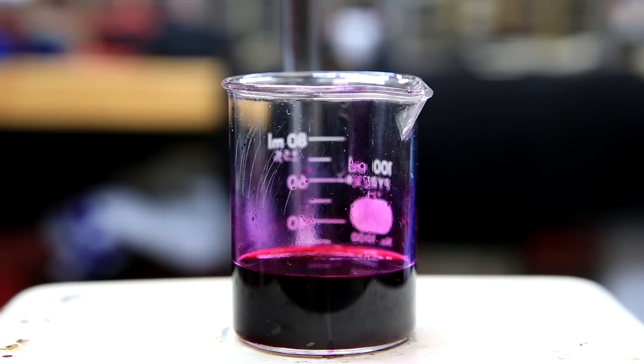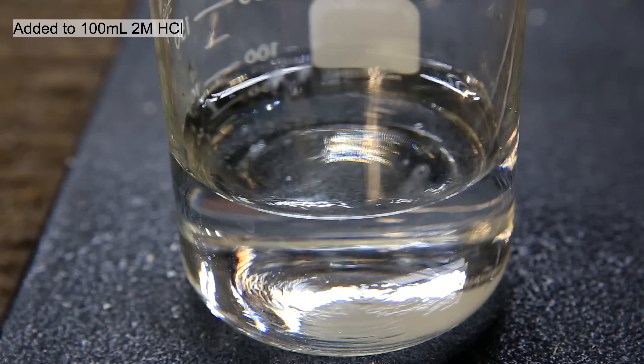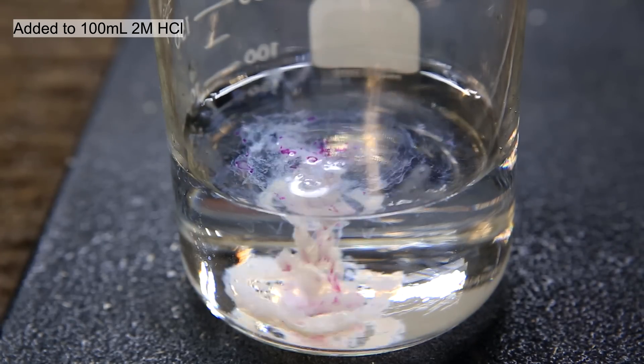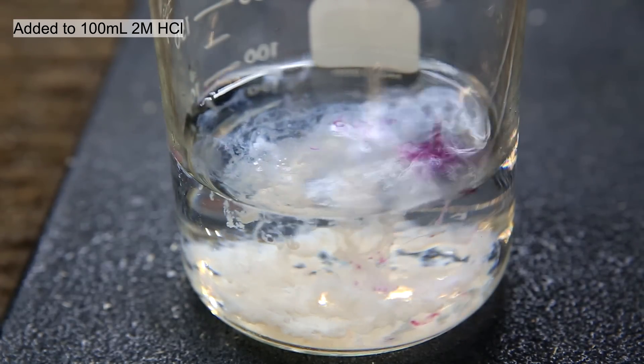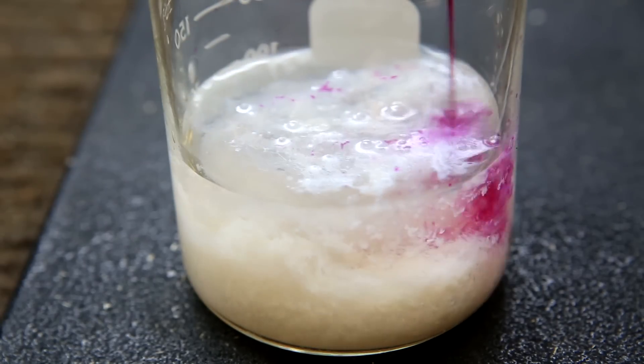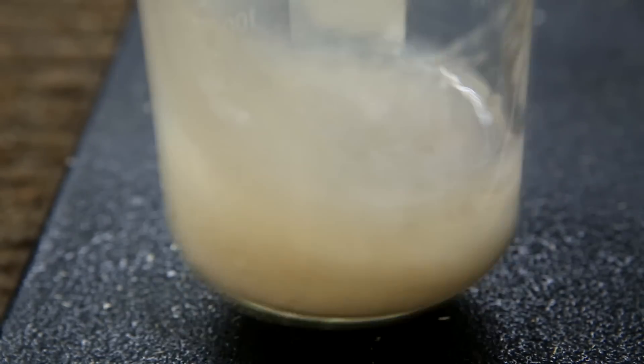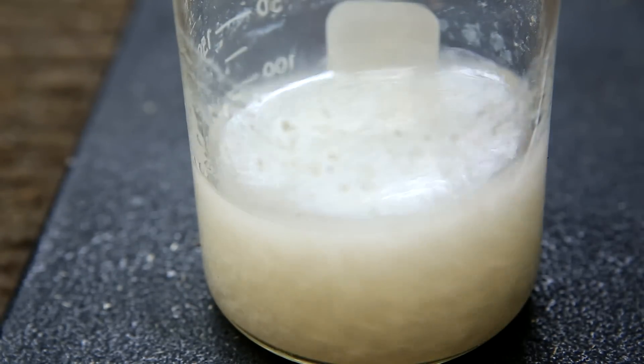This solution is very concentrated in phenolphthalein and is almost black. The phenolphthalein solution is then poured into 100 ml of 2 molar hydrochloric acid. This converts phenolphthalein back to its non-salt form, which is insoluble in water and causes it to crash out.